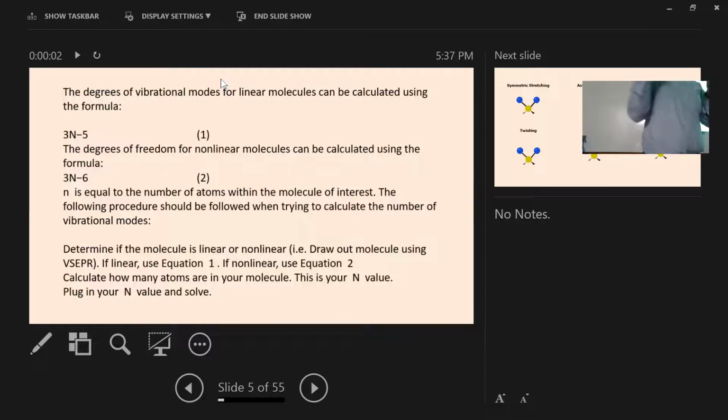So if you give some infrared light to the molecule, if the molecule has a permanent dipole moment, it can change the orientation or it can change the modes of vibration. Therefore, if you have the dipole moment in the molecule, in that case, the molecule can be infrared active or it will absorb the IR light. Okay.